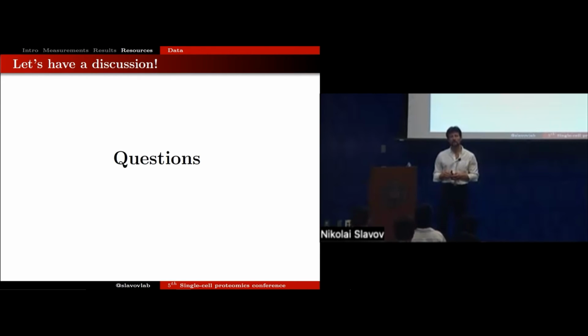So I think there is important work to be done there, especially in terms of benchmarking. One of the really important urgent things in my mind on that side is characterizing what the noise properties are in single-cell protein measurements. We know that there was a lot of work, hundreds of papers published on that for RNA sequencing in the early days. We don't yet have a single focused dedicated study on that question. So that's a useful thing to do.